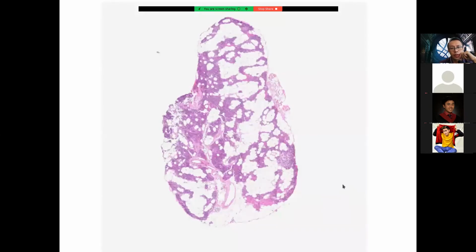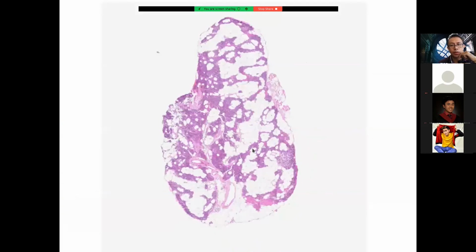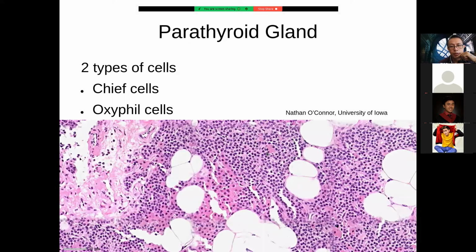Okay, so this is an older specimen, meaning in the passage of time, more fat will accumulate inside that parathyroid gland. So that's the feature. It's a glandular tissue, very compact, no cavities, no lumens, just cells and fat, in older specimens. And we have a distinction now of a very glandular looking tissue.